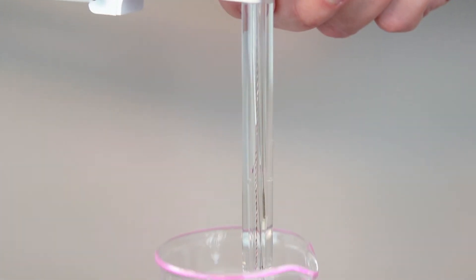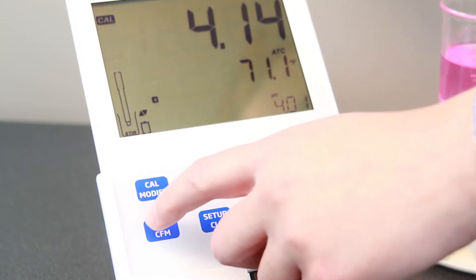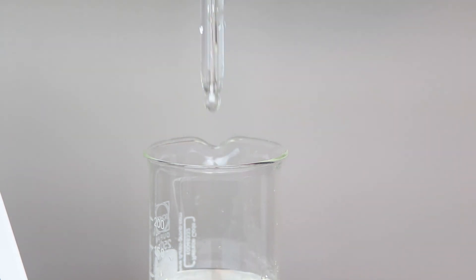Then place the electrode into your buffer. Once stable, press confirm and the meter will ask you for your second calibration point, pH 7.01. Rinse the electrode with deionized water and place it into the buffer.